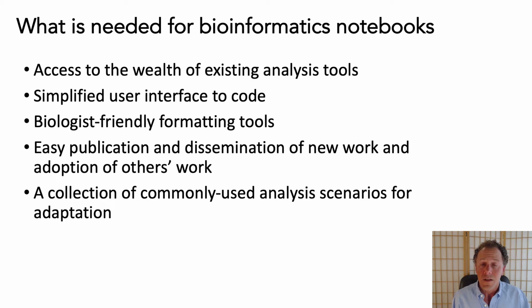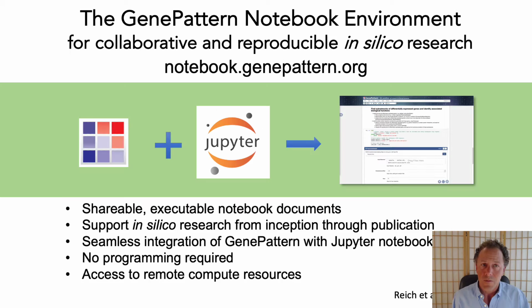These are the requirements that led to our development of the GenePattern notebook environment. This environment gives you all of the notebook features of Jupyter and is fully compatible with Jupyter and not a separate fork of the code. The GenePattern notebook environment adds the ability to utilize analyses from any GenePattern server, in addition to a number of other general features to make it easier both for non-programmers to have access to the full range of genomic analyses required for today's integrative genomics experiments, and for the notebook developers to make it easier for their own notebooks to be more accessible to users at all levels of computational sophistication.